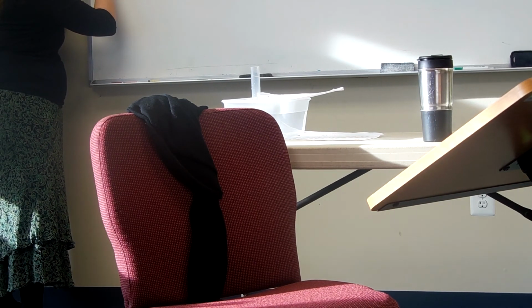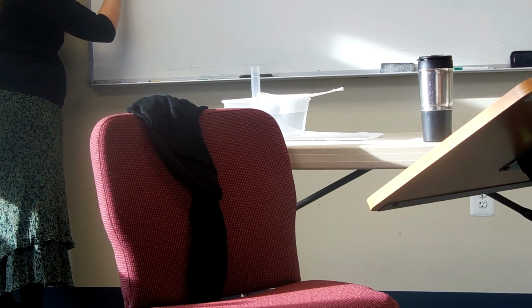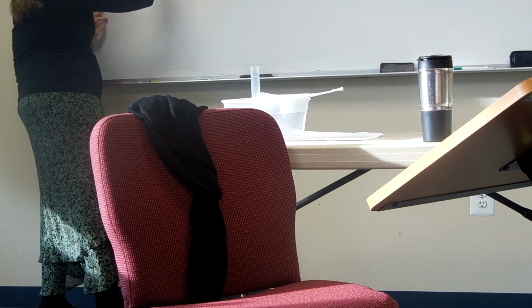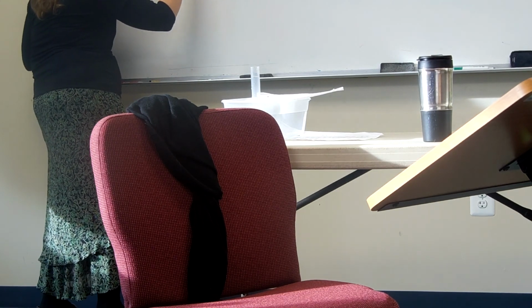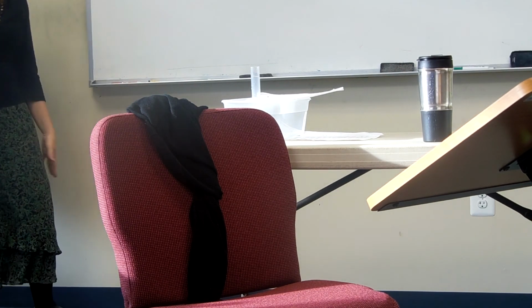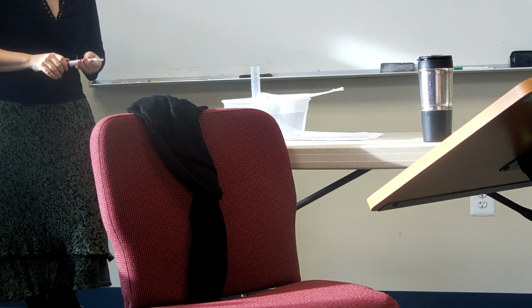What would you predict the limiting reactant would be for the group that gets 1.4 grams? Baking soda. Okay, from now on, when I say LR, that means limiting reactant. So we're predicting the limiting reactant for this group is baking soda. All right, for this group, what do we think the limiting reactant is? Baking soda. This is important stuff to write down. Although it may not be the case, we might find the real world answer doesn't agree with our math.